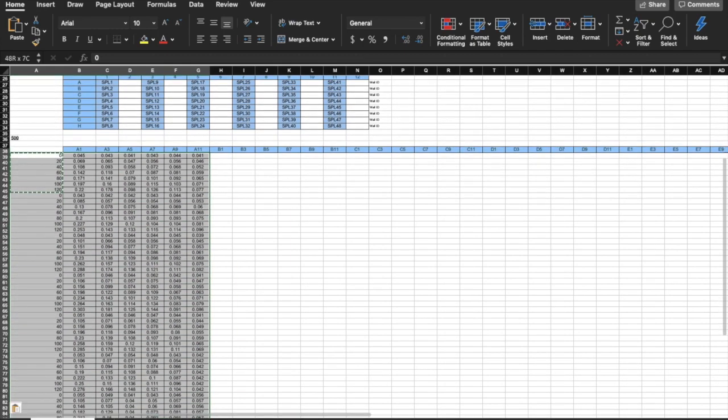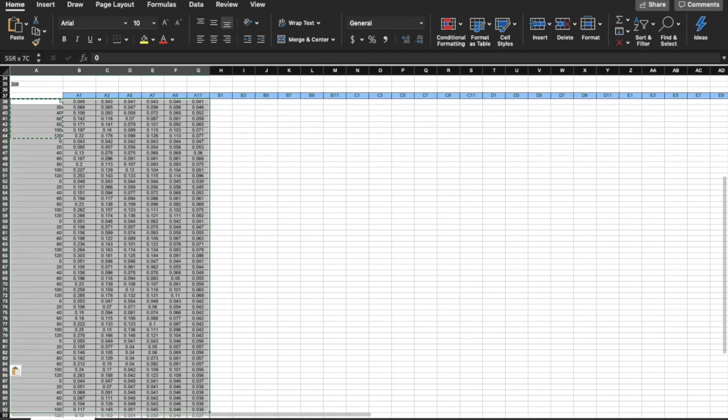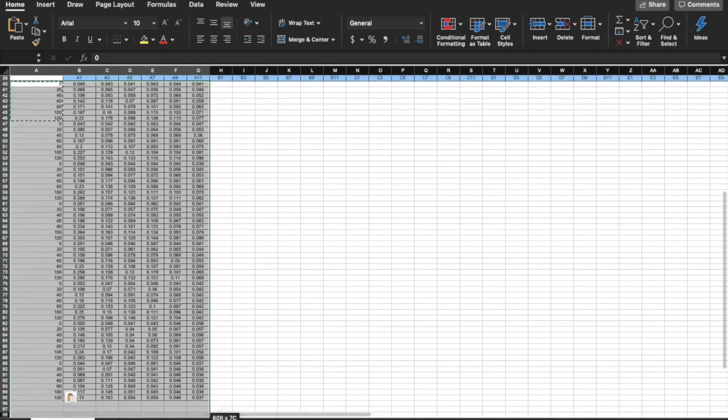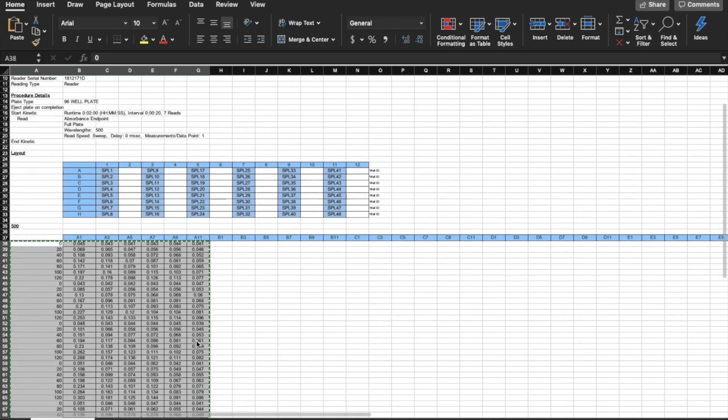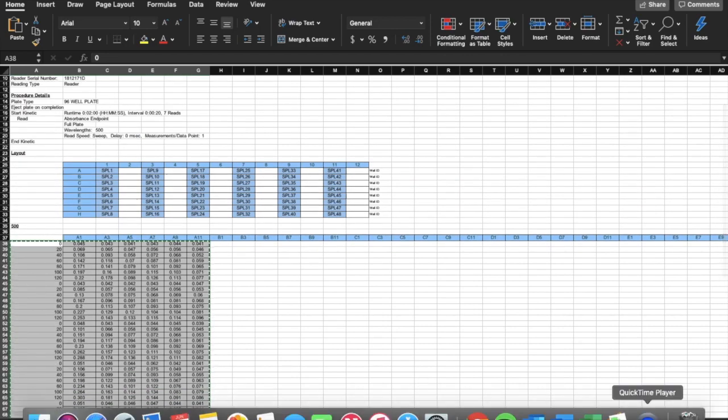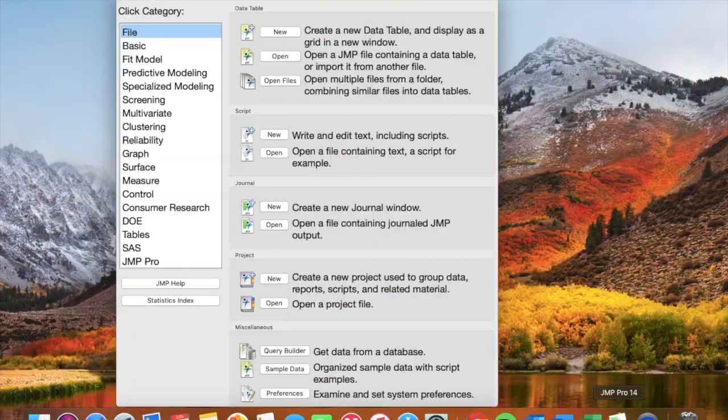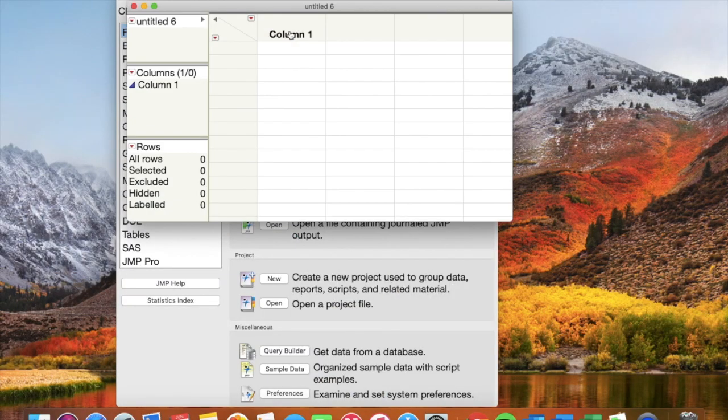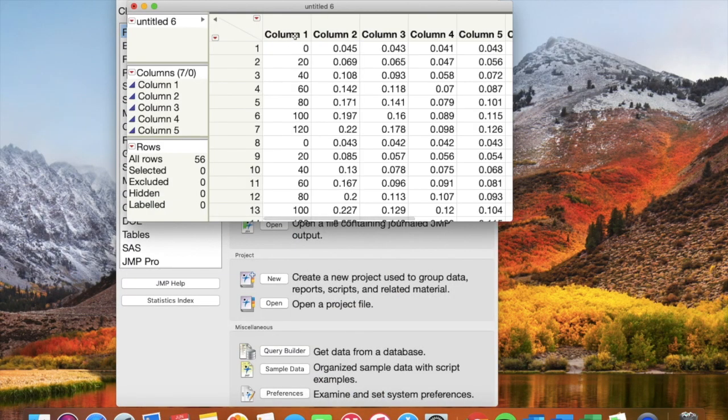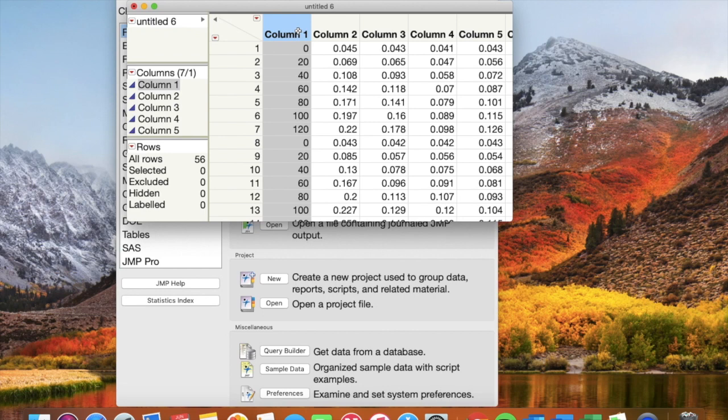Highlight all the data likewise. Copy and paste it into JMP. Next, label all your columns as shown.